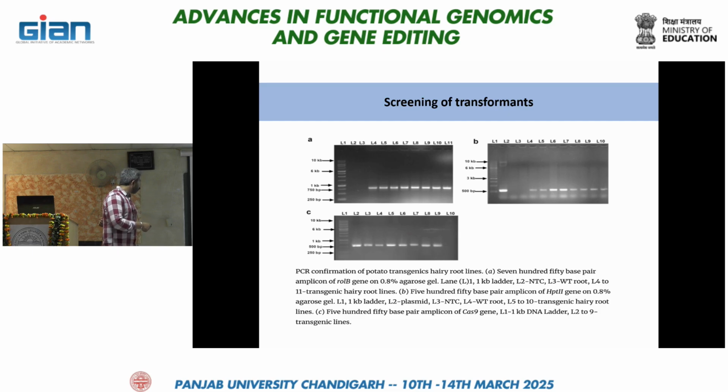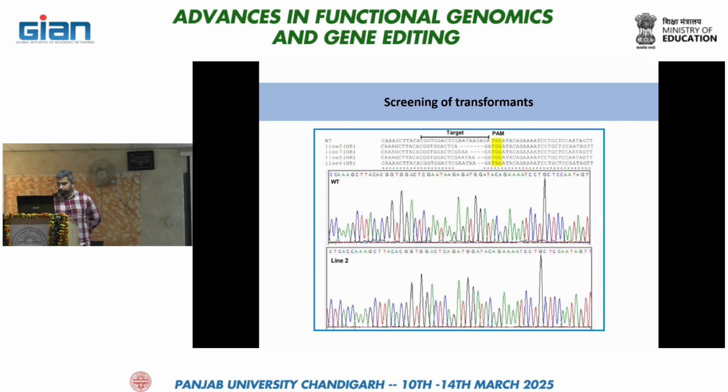And after that we have to elute it and simply clone it in a cloning vector like pJET. You can use pGEM-T or pJET as well. That all depends on your lab and whatever you want to use. And after cloning, you have to simply send your samples for sequencing, or if you have access to any sequencer, you can sequence your samples yourself, and the sequencing results will look like this.